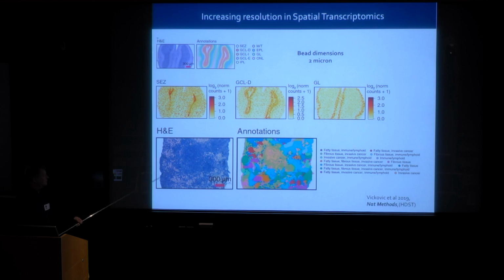And this is a case from tumors, and you could see the landscape of different cell types within the tumor, and it's a pretty messy image. And I'll come back to that later on, because that's a challenge, I would say, from a biology point of view.